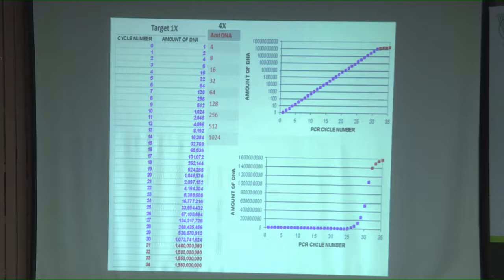But the interesting part is to make use of this technique in doing comparative study. I give you 5 samples and I ask you to find out in which sample gene A is expressing at the highest amount, or I ask you to rank these 5 samples in terms of the higher expression of gene A, right. So, there you have to do a comparative study. In doing that I take you to the basic process of PCR, how it works. Suppose you are running a PCR.